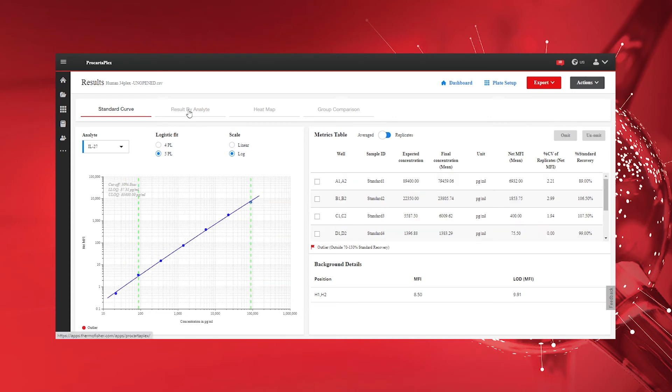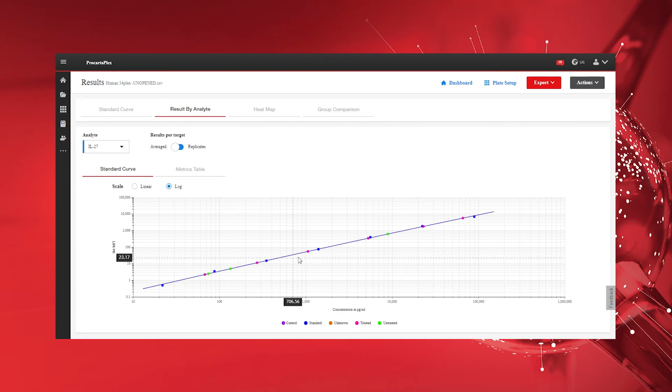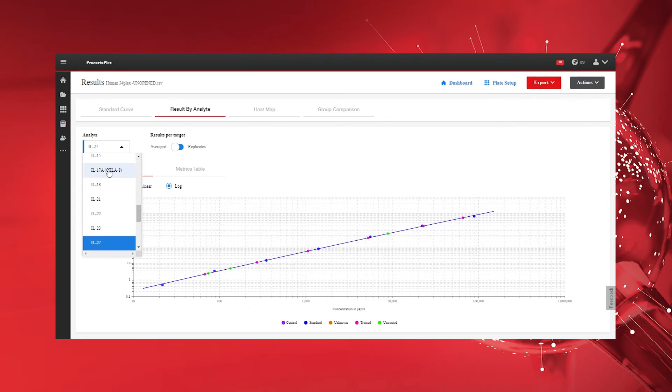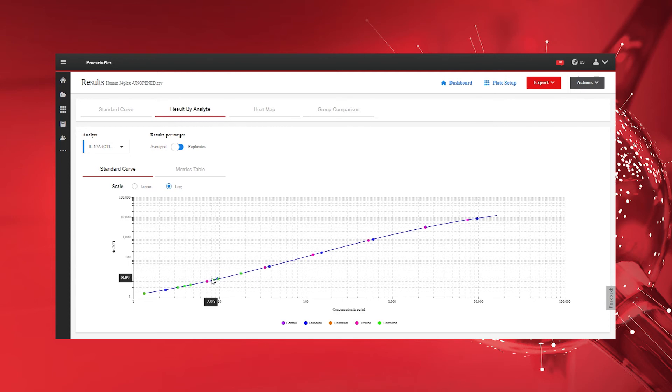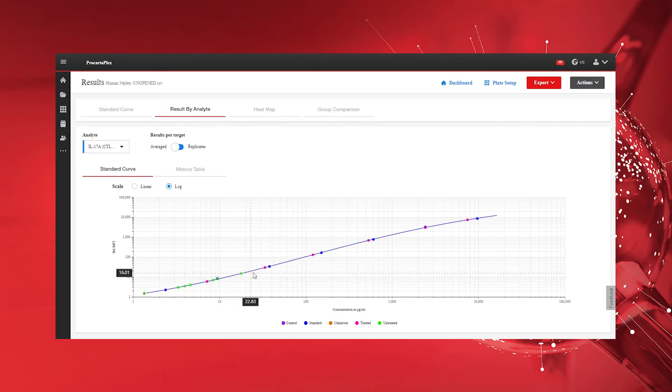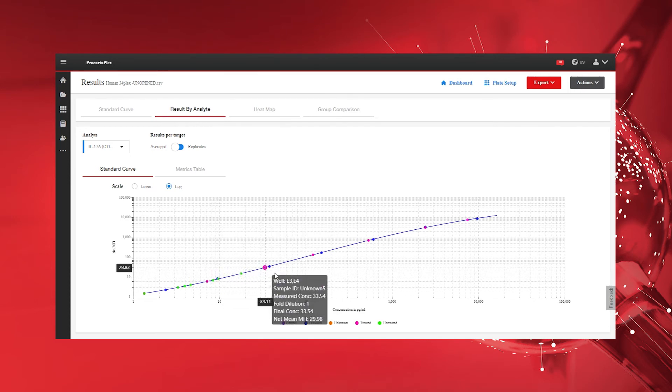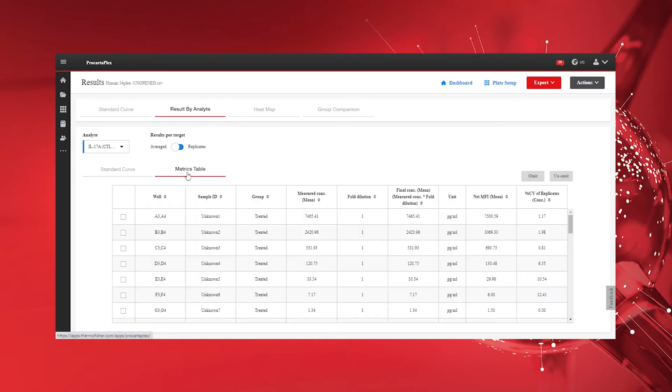Navigate to the Results by Analyte tab to view your samples and standard points plotted onto the Standard Curve. Click on Metrics table to get a tabular view of your measured results.